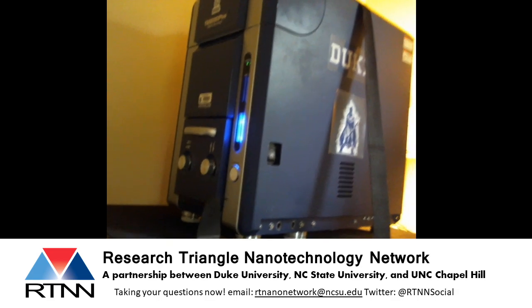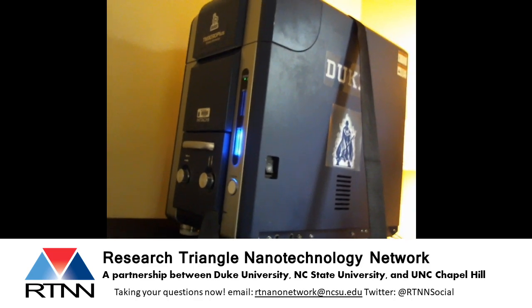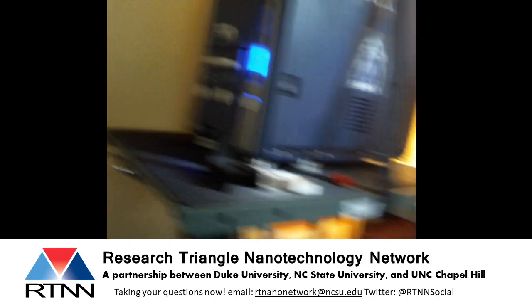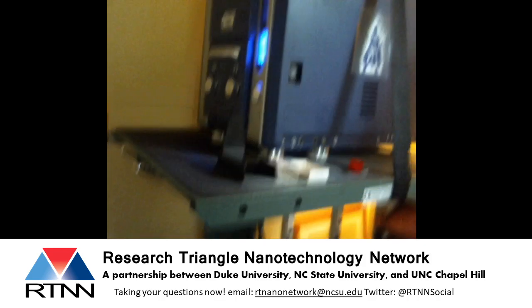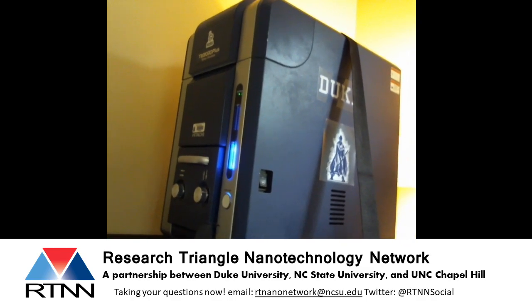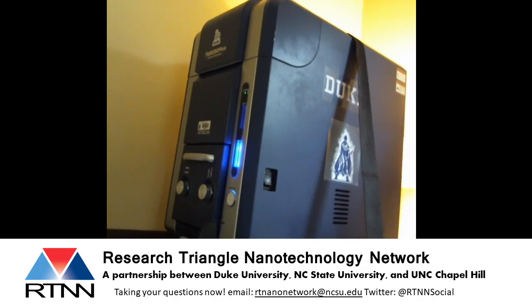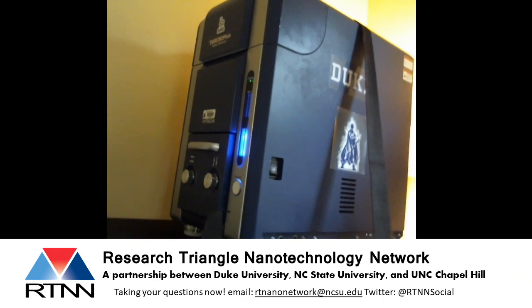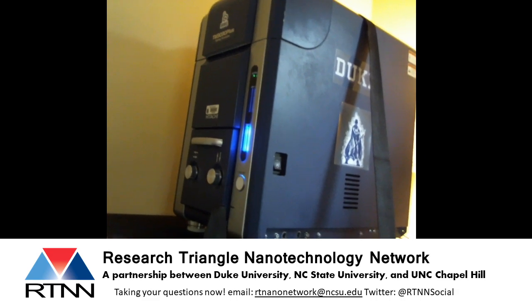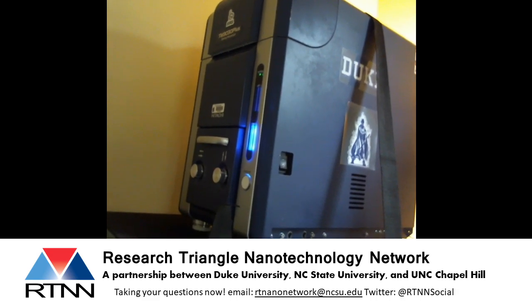But we're lucky that some of the technology for making these microscopes has evolved to make them a little bit smaller. And so this microscope is sitting here on a cart that we can wheel around. We've brought it to a number of places around the community, such as schools and libraries, to let people see how cool scanning electron microscopy is and to let people look up super duper close at things.